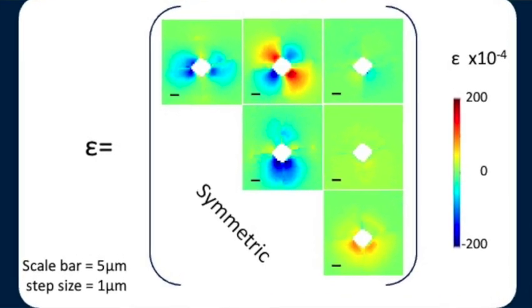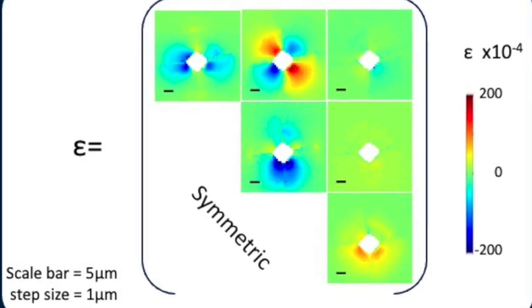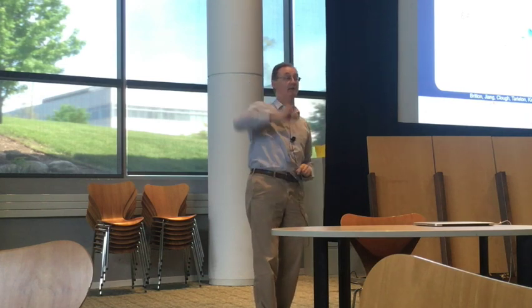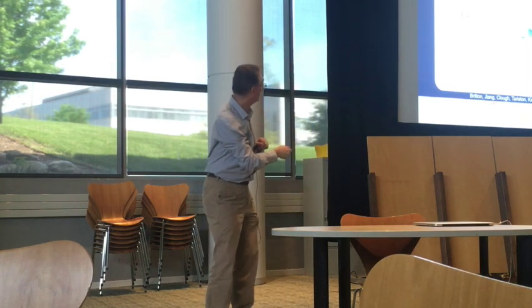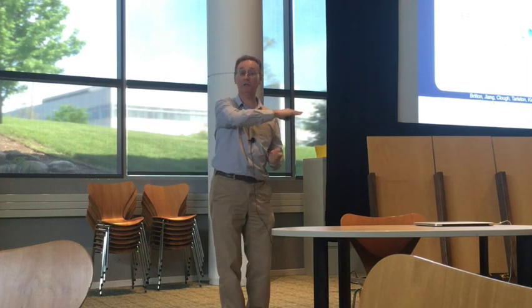If we look along the x2 direction, so that's going up vertically, again you see a similar thing, but it's all rotated around. Material's getting pushed out top and bottom, that leads to a compression along that axis. In these regions in here, either side, we get a tension, but it's relieved because there's a crack.